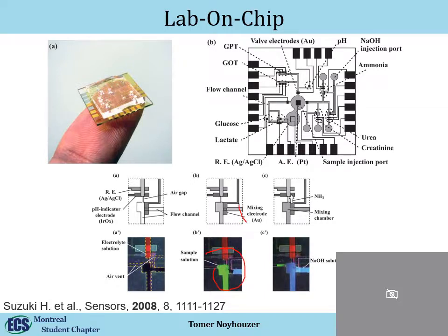You have your mixing chamber here, right? So you need to have a mixing chamber. You can design it in a sandwich form. And I think this one is in a sandwich form because you see you have the bottom layer and the top layer, which is a little thicker that sits on top of all the printed circuit.